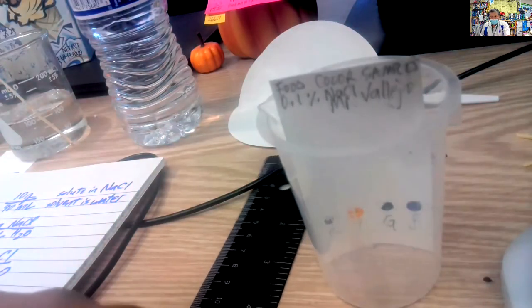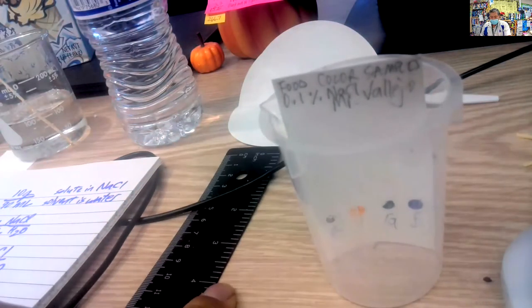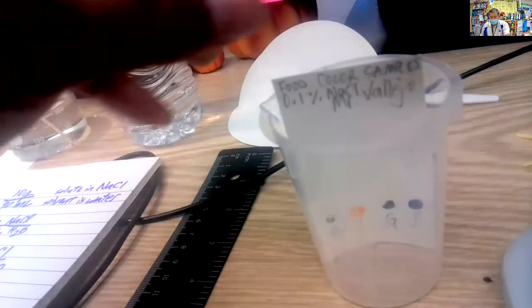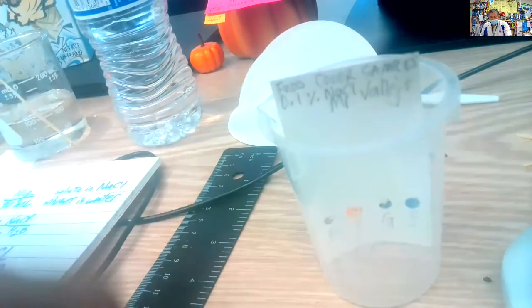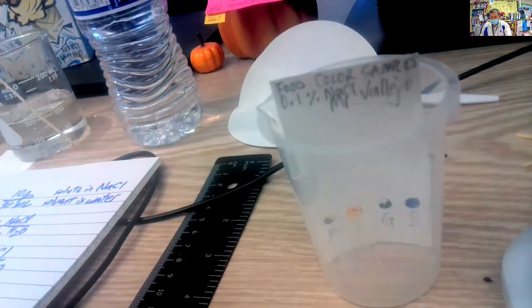We're going to dry fit this. We're going to take this and put this in here like this, right? But we're going to put the liquid in there a little bit. What's going to happen is the liquid, as it goes up the paper, is going to separate the chemicals that are in the food dye.